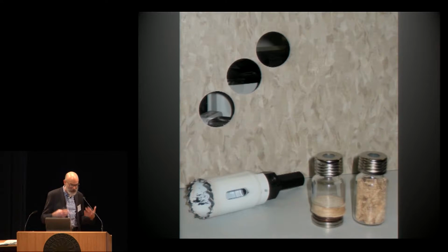The other form that you may want to consider is this: for many of your materials in an exhibition case, only one side of that material is exposed to your work of art. So I've set up a situation where I've chopped off one of these sample vials. I've got a hole cutter from Home Depot that I use to cut my material of interest, with silicone grease. I use vacuum silicone grease, which itself does not off-gas, so I'm sure that all I'm getting in my analysis are things from the sample.